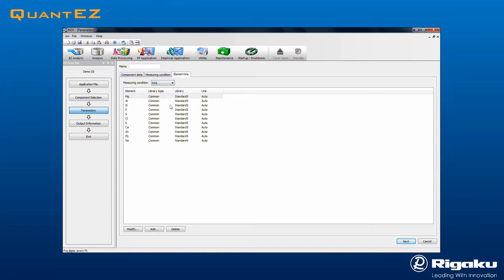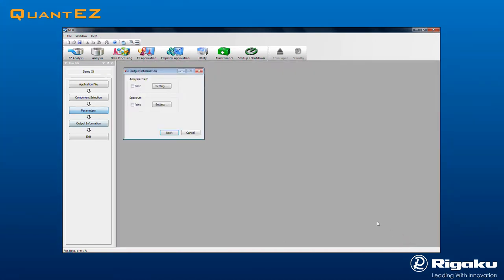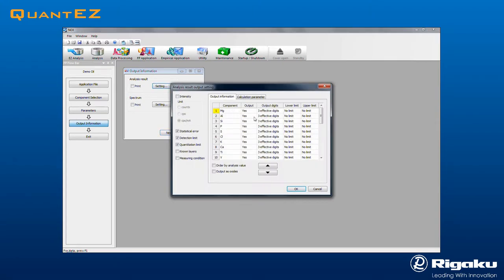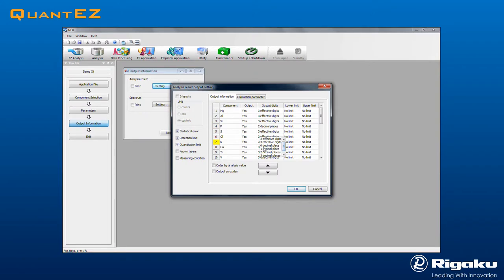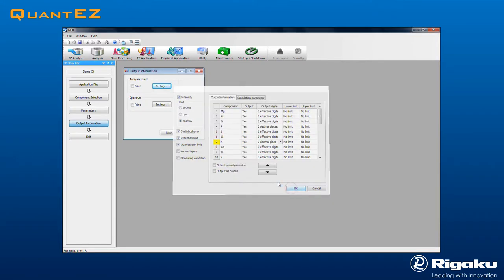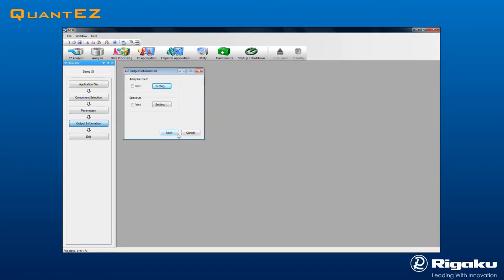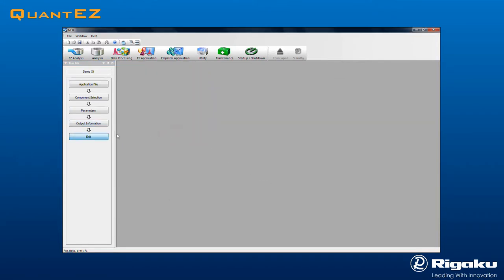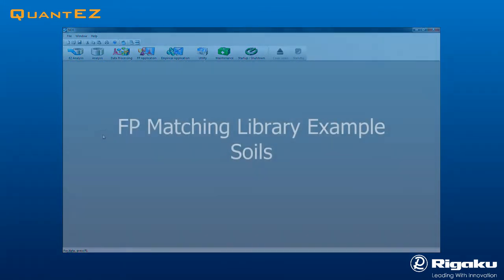Clicking Next brings up the Output Information dialog box, where the Results report may be designated. Select the number of significant digits required. One can also select whether to show other information. Then click OK to exit, followed by Next and Exit to complete.